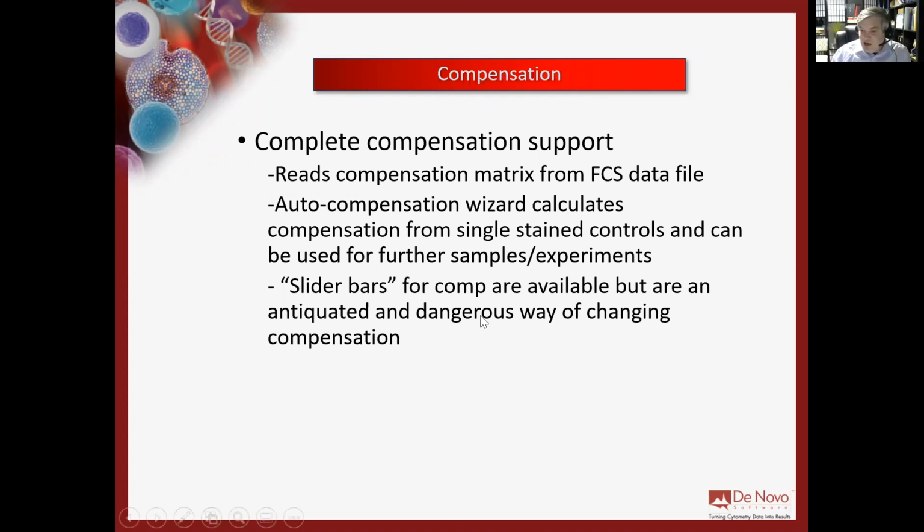So slider bars for compensation are available, but they're really an antiquated and actually quite dangerous way of changing compensation, right? I'm going to focus on that in just a little bit. But if you're using slider bars, you are actually moving your data around in the plot without any sort of guidance, right? And that's a very important thing to note, right? That's how, you know, grants can be lost. That's how papers can be returned to you. We want you to avoid that kind of stuff and just use proper controls. If you use the proper controls, it's going to work every single time, even if you don't use FCS Express. So I can't stress that enough.